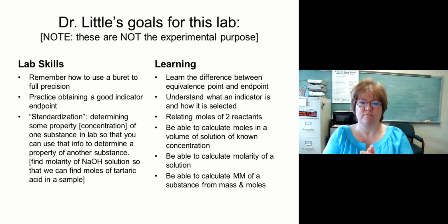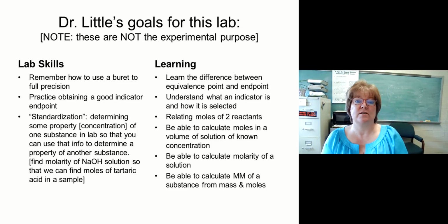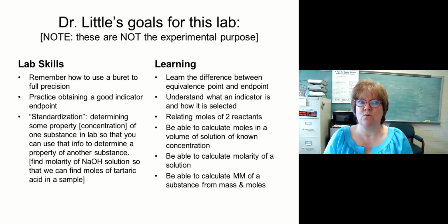This week's lab is about titration. We've done titration before in 123, but we're going to focus on a few other things. So these are not our experimental goals, but this is the lab skills and the learning. The experimental goals you can get from the lab manual.